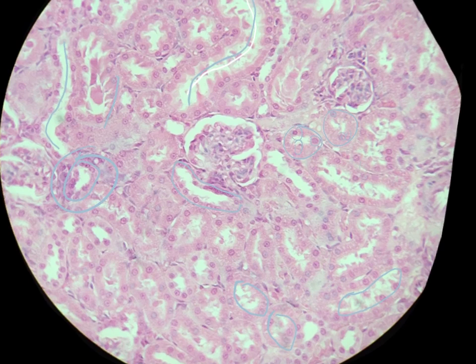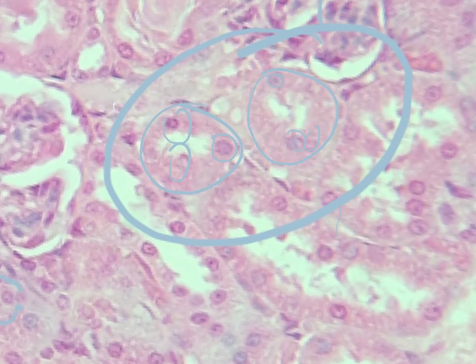And so you'll tend to get cuts that look like this, where it looks like there are only 3 nuclei within the proximal convoluted tubule. It appears that way, but in fact what you've done is you've just happened to have not cut through the nucleus in this area here and this area here. Those are cells. There are probably 9 cells that make up the border of this tubule, but they're just so big that when you cut through them, you don't happen to hit the nucleus every time. And so again, that's one way to be able to judge the size of an individual cell in 3 dimensions.